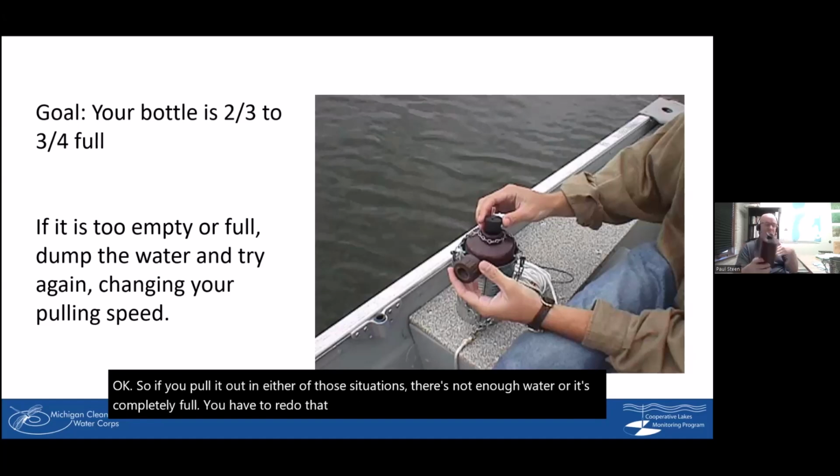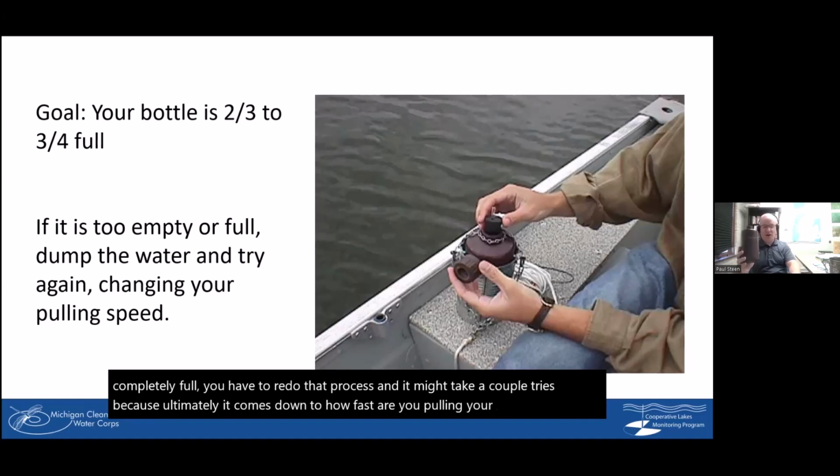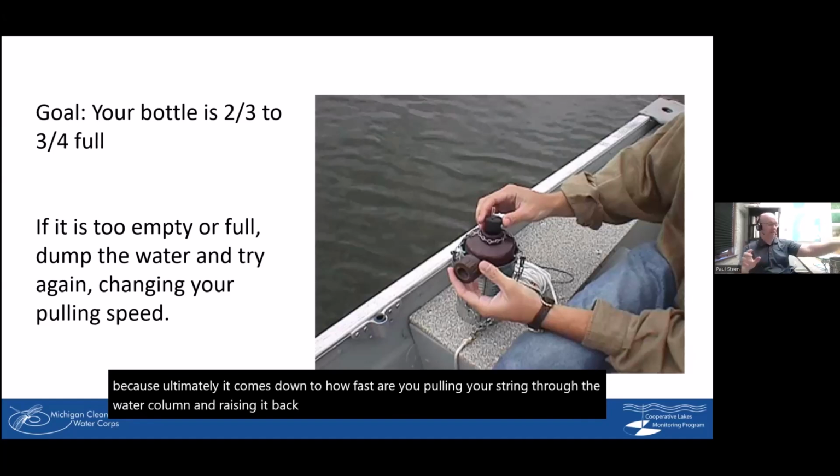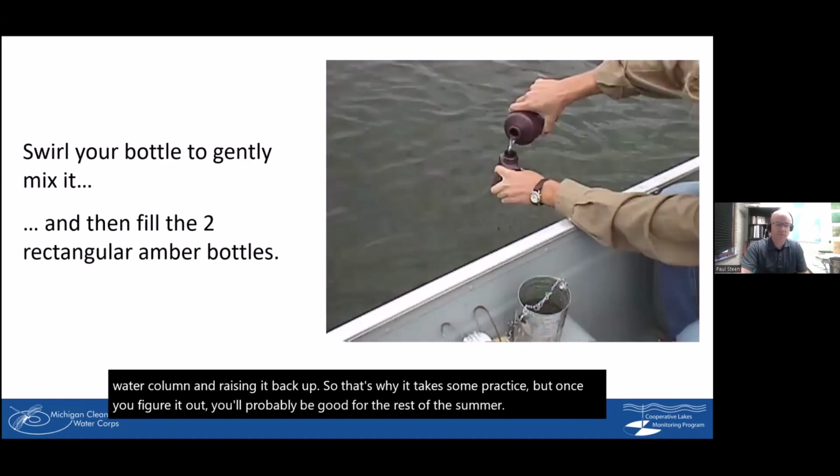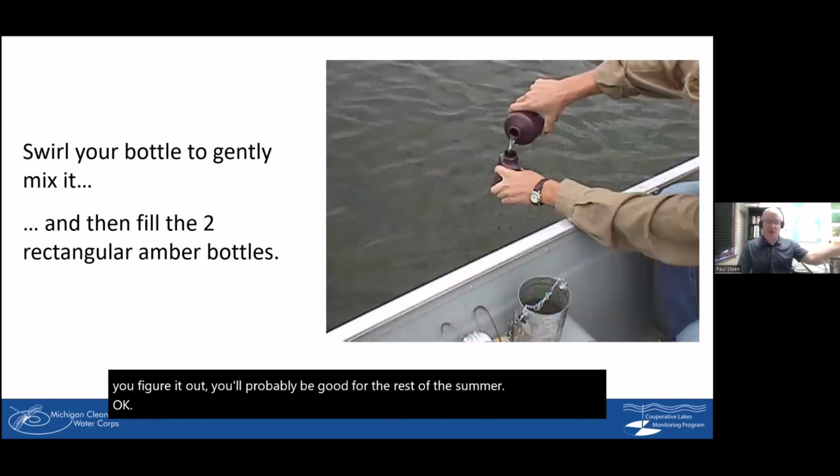And it might take a couple tries because ultimately it comes down to how fast you are pulling your string through the water column and raising it back up. So that's why it takes some practice. But once you figure it out, you'll probably be good for the rest of the summer. Okay. So you have a good amount in here.